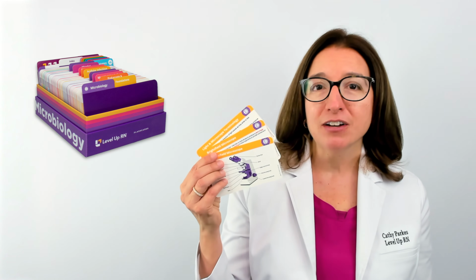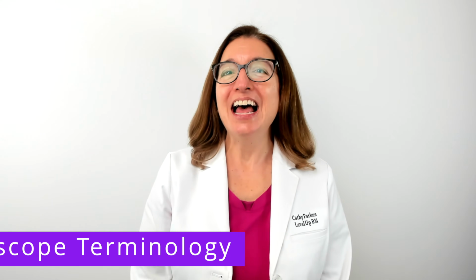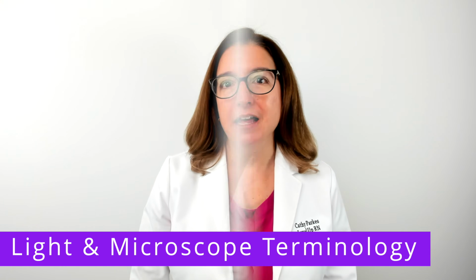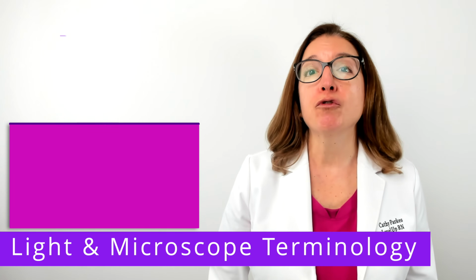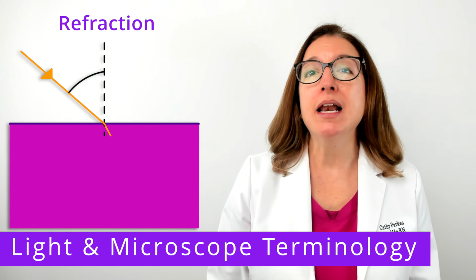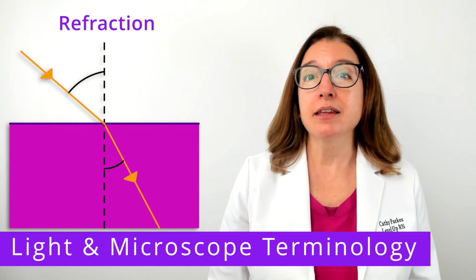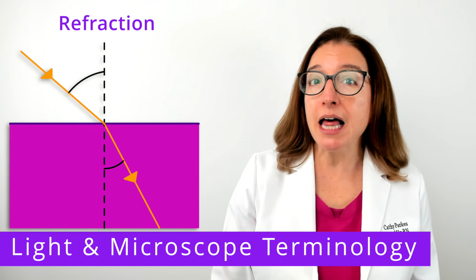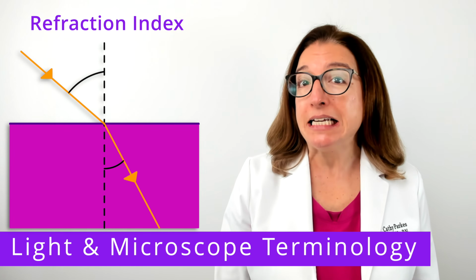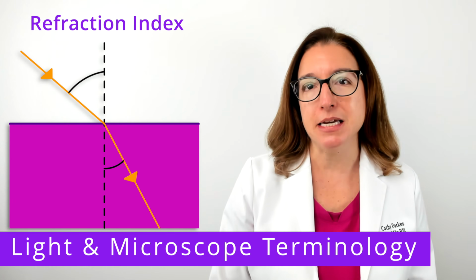And if you have our Level Up RN micro flashcards, go ahead and pull them out so you can follow along with me. Let's first go over some important terminology related to light and microscopes. The first term I would be familiar with is refraction. This refers to the change in direction of a light wave when it enters a new medium or material. So, for example, when light passes through the air into glass, this changes the direction of the light wave. The refraction index of a medium or material is the light bending ability of that medium.